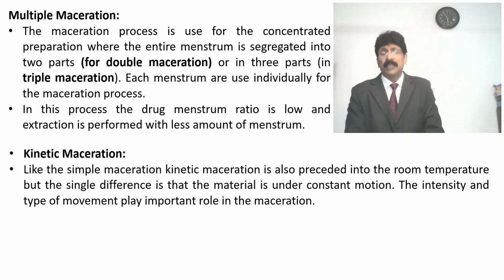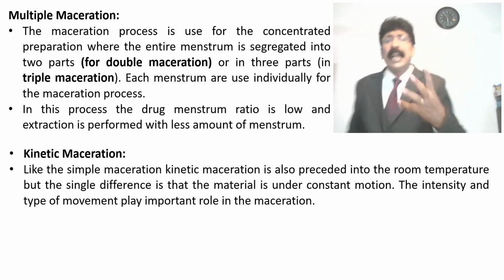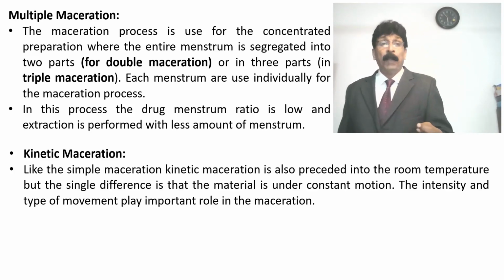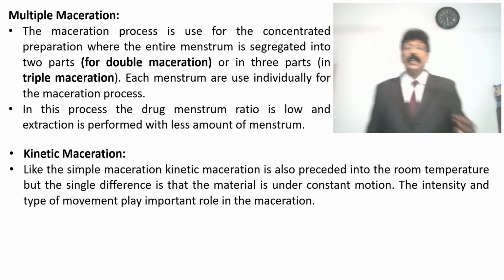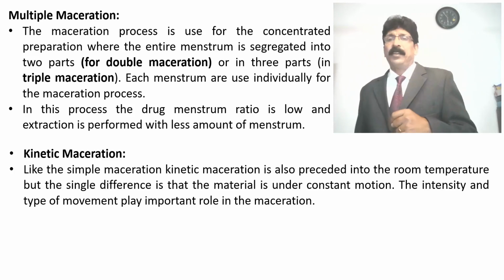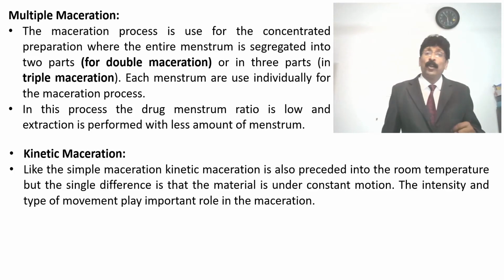Kinetic maceration. Like simple maceration, here you are giving some energy. Kinetic maceration is also carried out at room temperature, but the single difference is that the material is under constant motion. The intensity and the type of movement play an important role in the maceration.